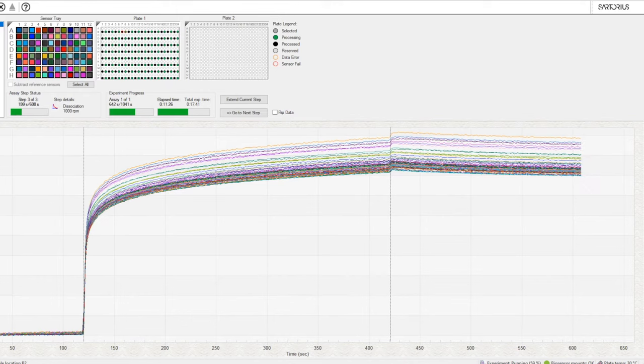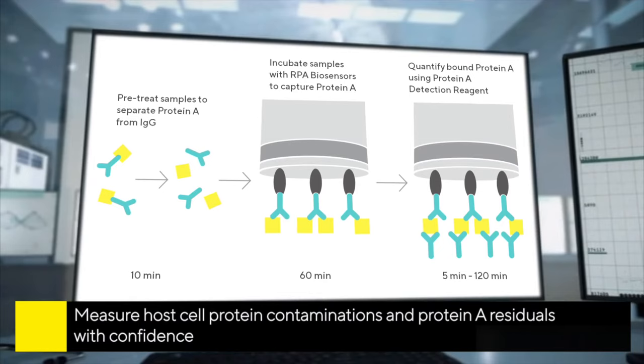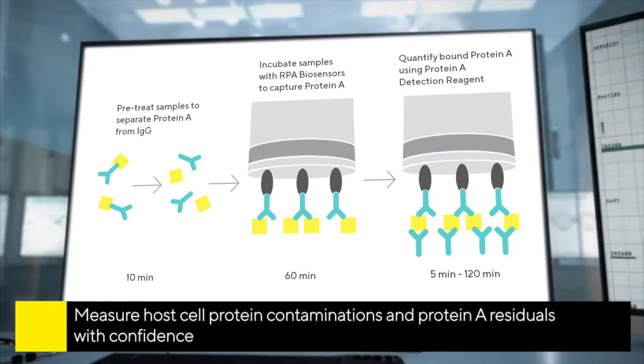The system provides 384 binding kinetics results in as little as 15 minutes. You can also perform customized multi-step quantification assays for applications such as host-cell protein contamination and residual protein A detection, allowing detection of sub-nanogram per milliliter concentrations.